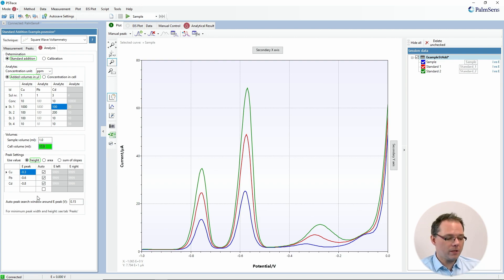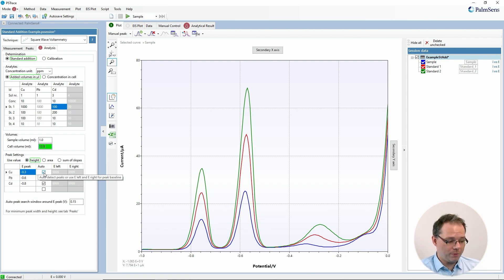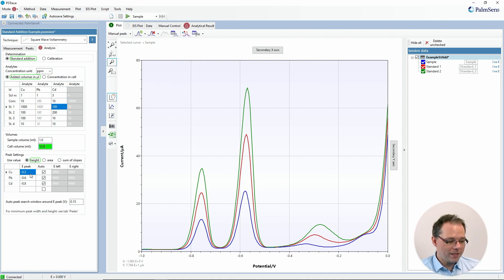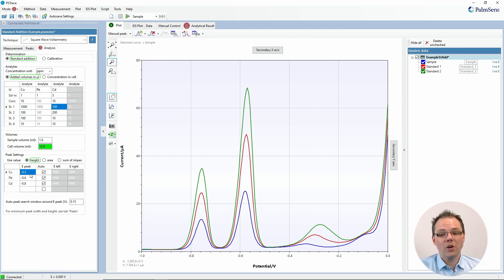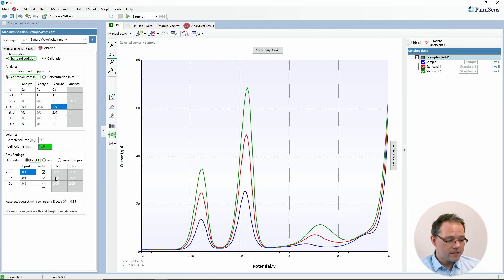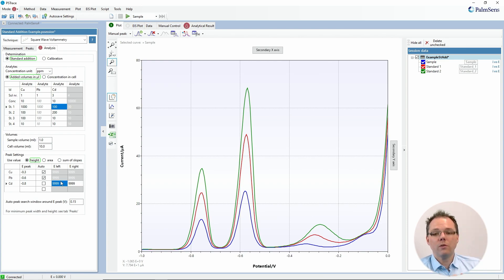The last window helps you determine how to evaluate your signal. For each of the different analytes you put where you roughly expect the peak, and then you can choose auto search for the peak. The auto search will happen within the window you have defined — so the copper peak can deviate a maximum of 150 millivolts before the software will not find it. Another option, if your peaks are not easily found, is to remove the checkbox from auto and instead put in manual borders, and it will look for the highest point between those two values.